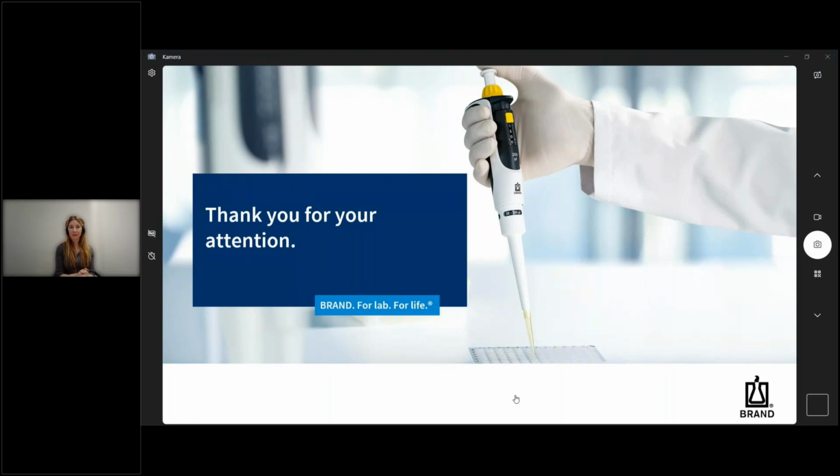Thank you. A second question is about the PLT unit and steppers. Can the PLT unit also be used to check steppers?